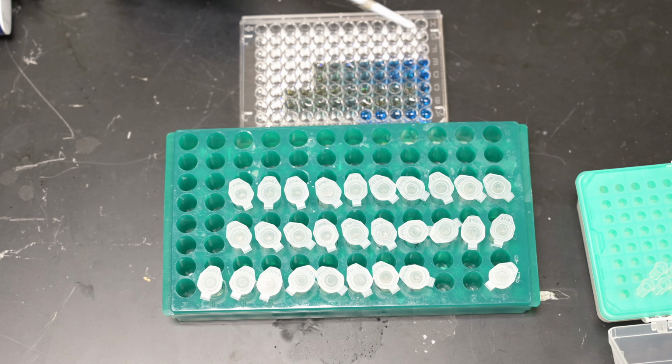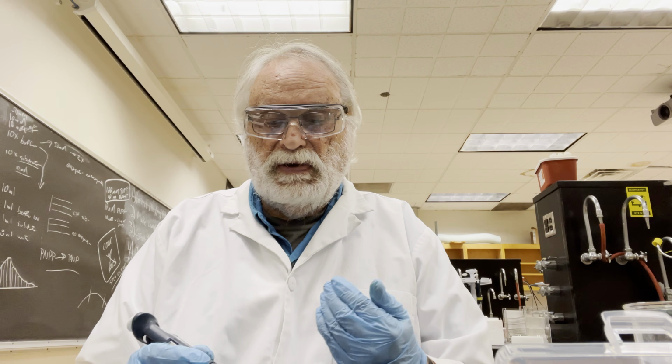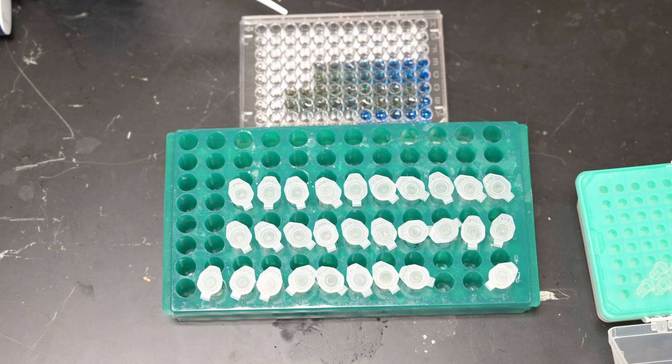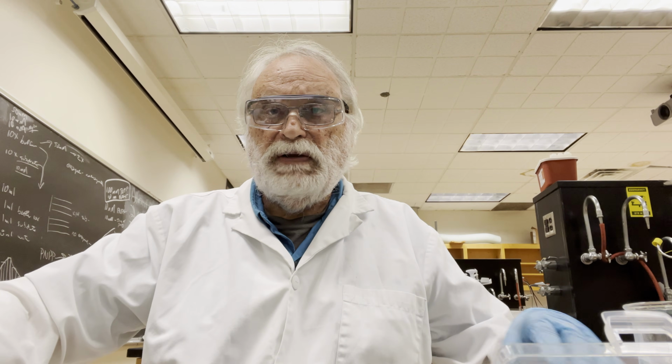Rows F, G, and H are empty for me because I only did just the wild type. We do the experimental, so you'll have equivalent samples on here. It'd be lysate, 2-fold, 4-fold, load 1, load 2, wash 1 to 5, 0.1 molar, elution 1 to 5, 0.3 molar 1 to 5, and 0.6 molar 1 to 5 on your plate. Go ahead, and these need to sit for about 2 to 5 minutes, and then give them to me or the TA, and we'll read them on the plate reader.